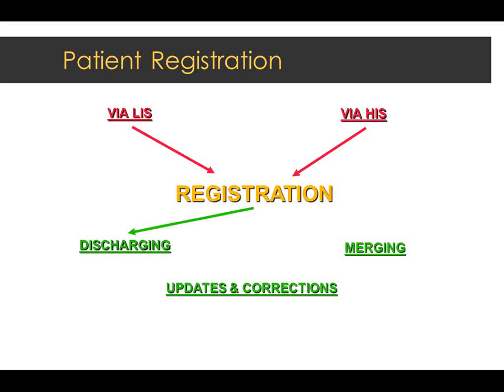But eventually, especially at a place like this where patients may come here for some very specialized service and then go away and never come back again, you don't want to keep those patients in your laboratory system. We need to keep the records in the EHR, but we're not going to keep them in as active patients. You just have a huge database overhead to keep all these inactive patients present. So after a period of time, you need to get them out of the system. Okay, so we can discharge them out of the system.